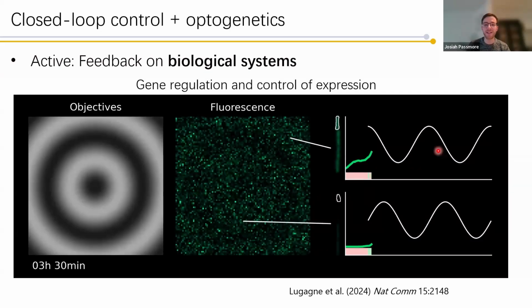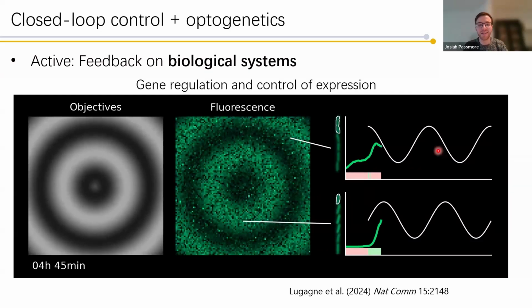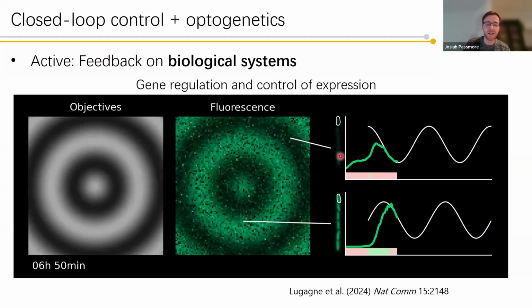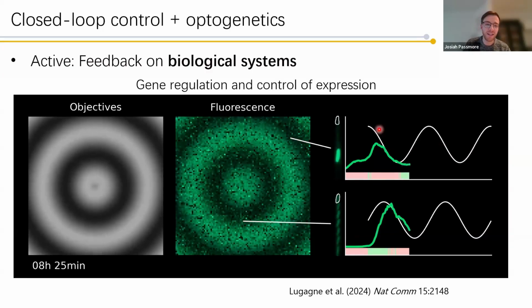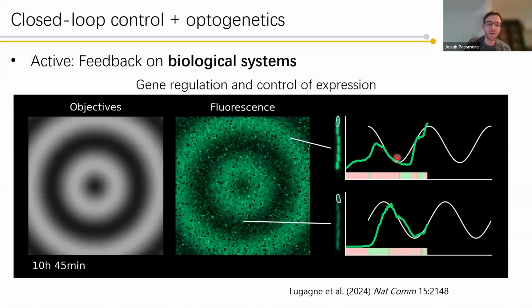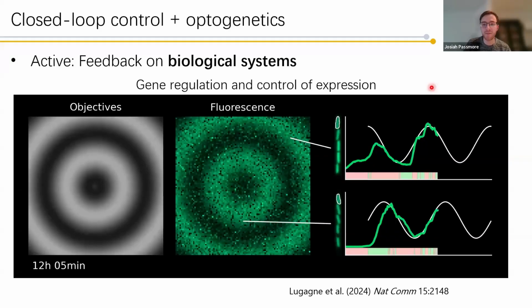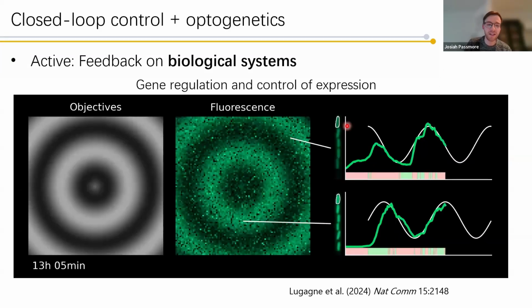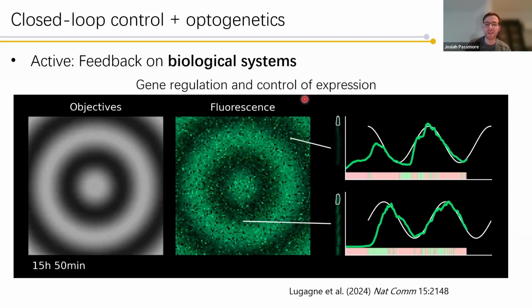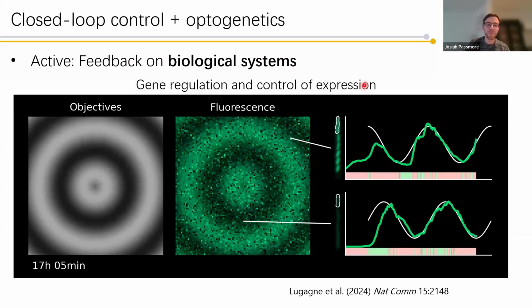And another great example is from Jean-Baptiste, where you can take individual bacteria, immobilize them in a mother machine, and selectively illuminate individual bacteria according to a regime of how you want their expression to be. You can then treat each individual bacterium as a pixel in a movie, such that you can represent these individual movies.